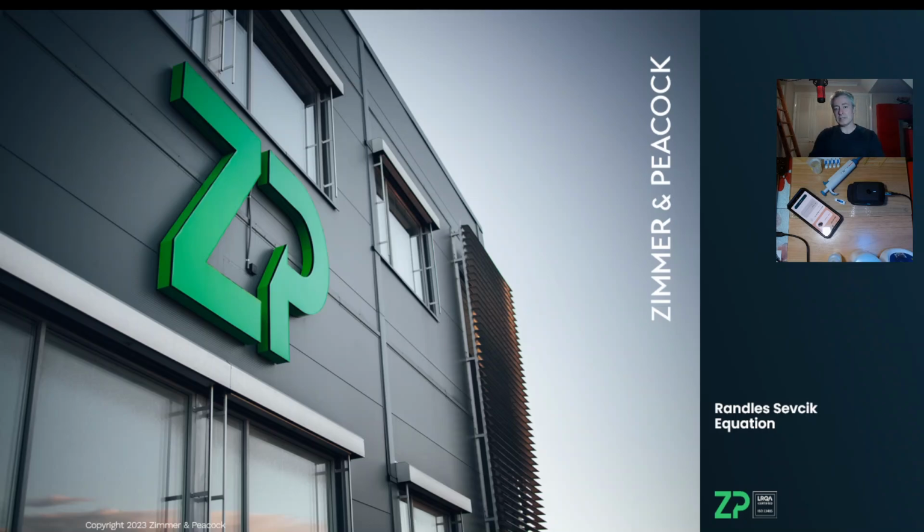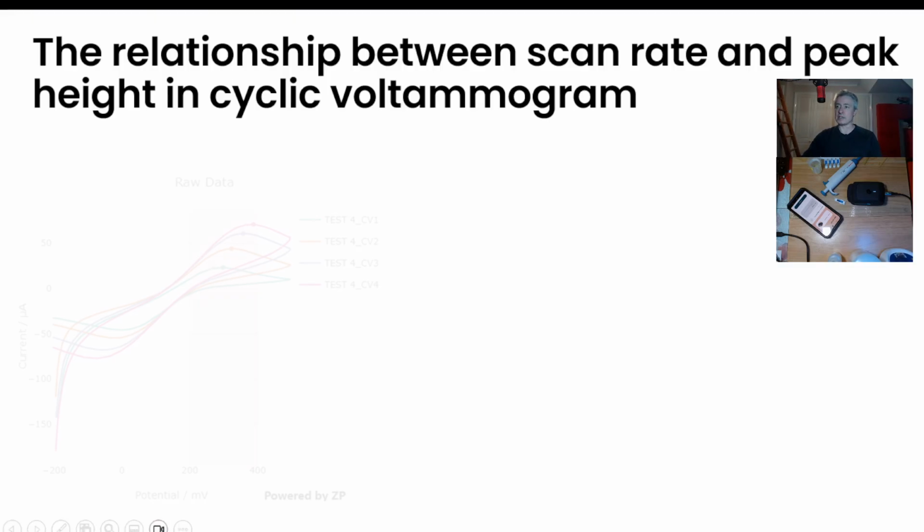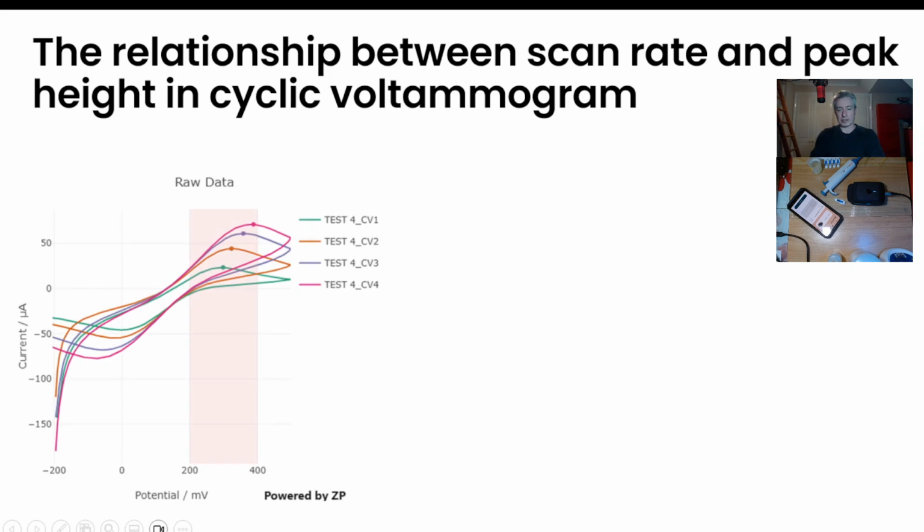Hi, good evening. In this video, I'm going to talk about the Randles-Sevcik equation. If you're familiar with cyclic voltammetry, you'll know that people like to characterize their redox system, the redox system being the redox active molecule. In my case tonight, it'll be ferricyanide, and my electrode will be a screen printed carbon electrode.